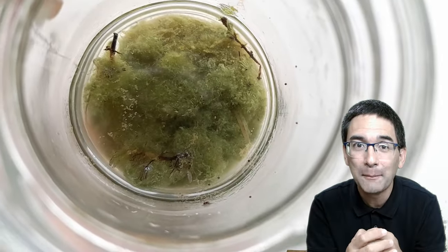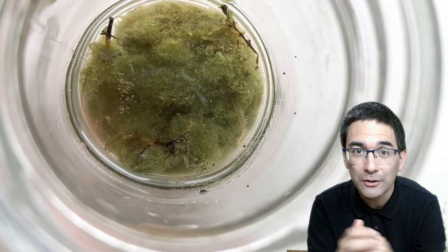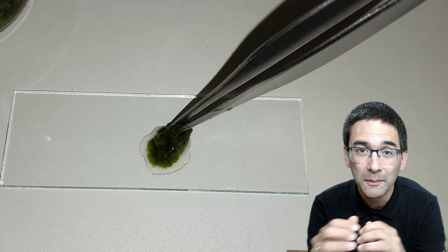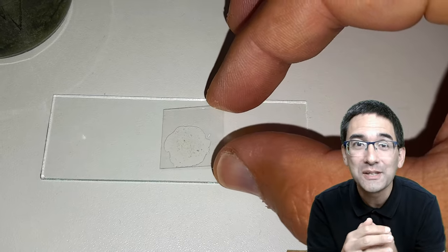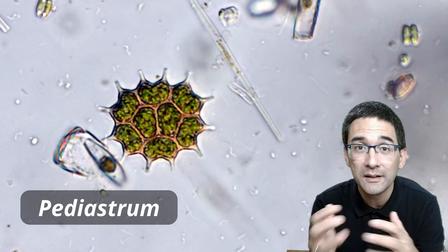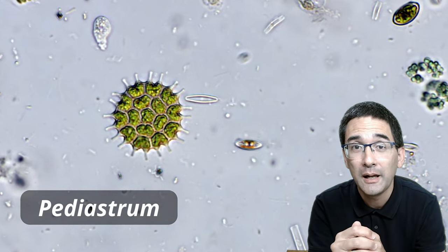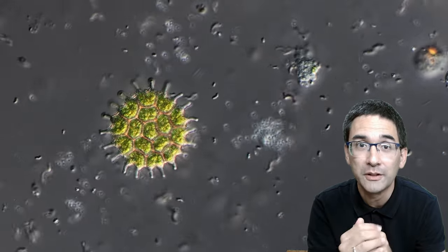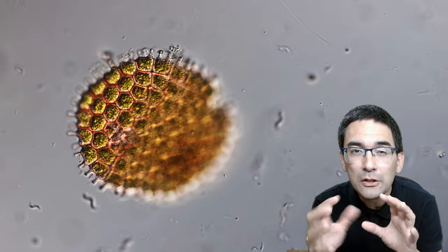It's a very quiet place compared to the busyness of the large city. Looking at the sample about a week and a half later, I made some temporary mounts. I dipped some of the algae on a microscope slide with a cover glass and was able to see a lot of planktonic algae — these algae float around in the water. It's a colonial algae that is very common with very nice shapes, and you can also see the individual cells. Around it you can see a lot of bacteria, which is already a sign that the water sample started to decompose.